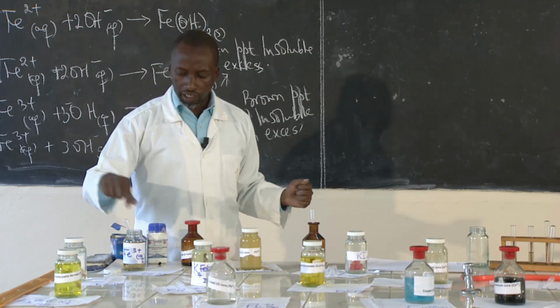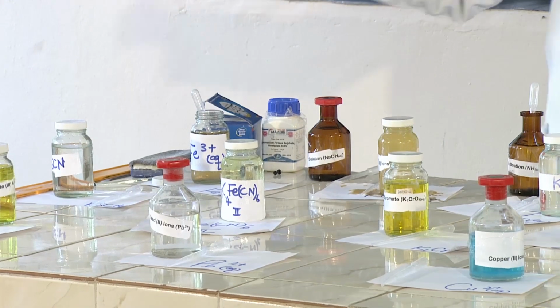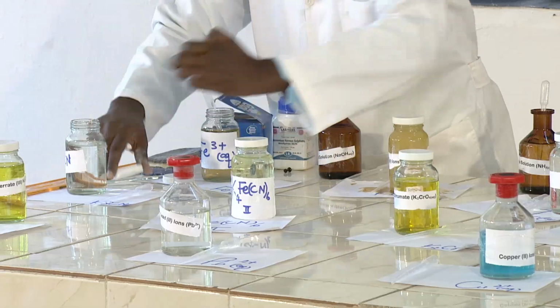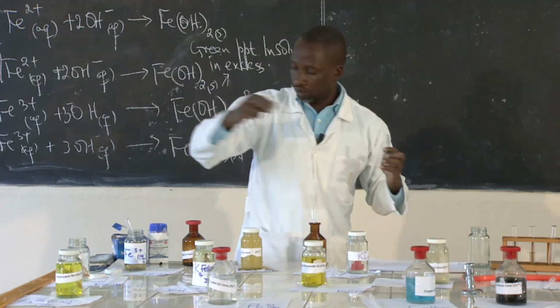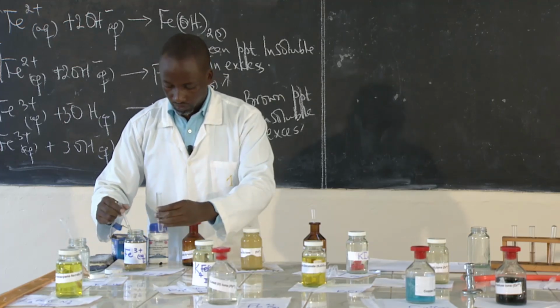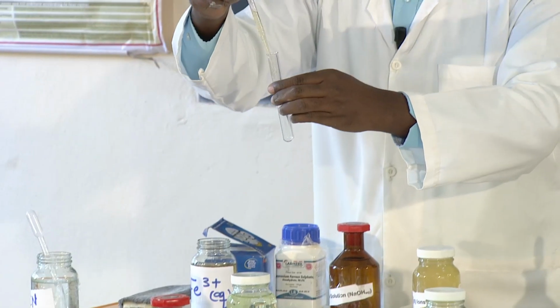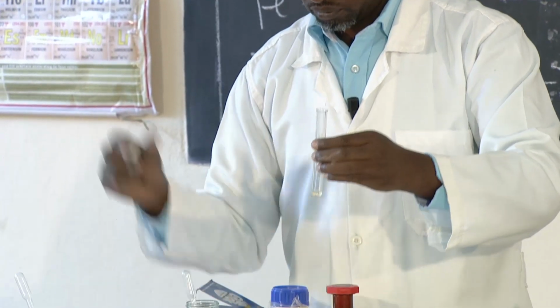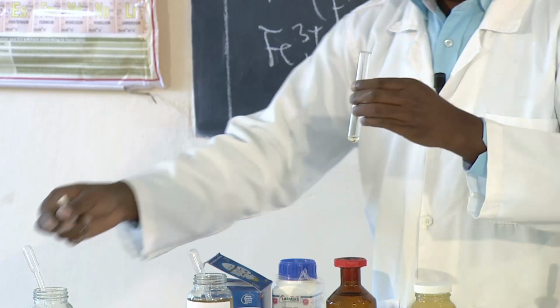So with the iron 3, I'll look at the effect of potassium thiocyanate. That's iron 3, a few drops.